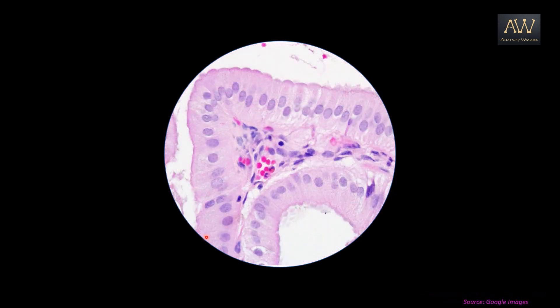Here is another example of columnar epithelium. You can see these slightly oval shaped nuclei. But also, what you can see is the clear demarcation of the epithelial cells which are columnar in shape, having more height than width. So again, this is a typical example of simple columnar epithelium.